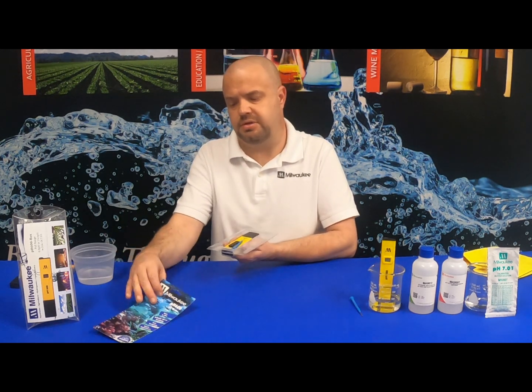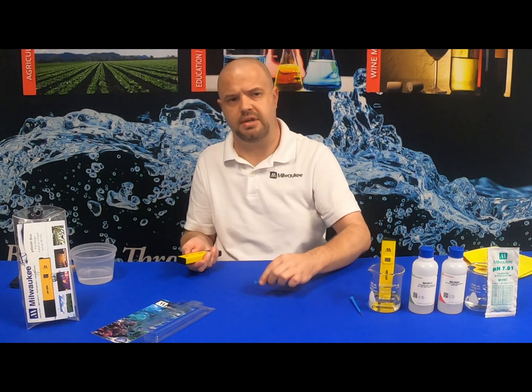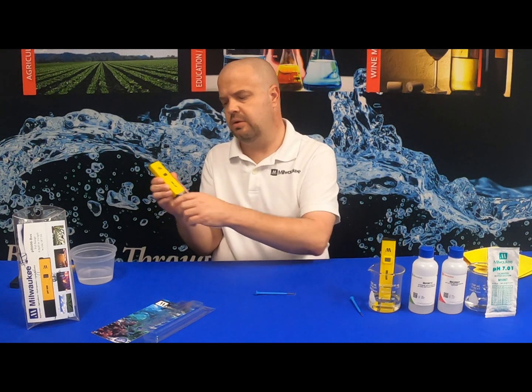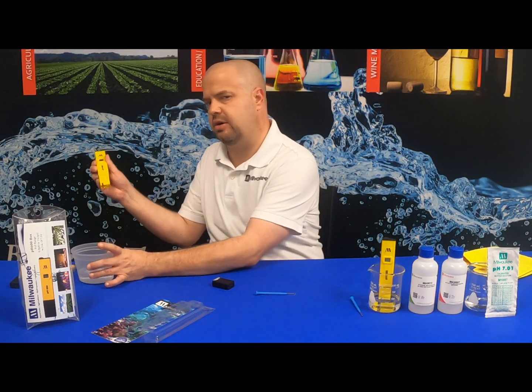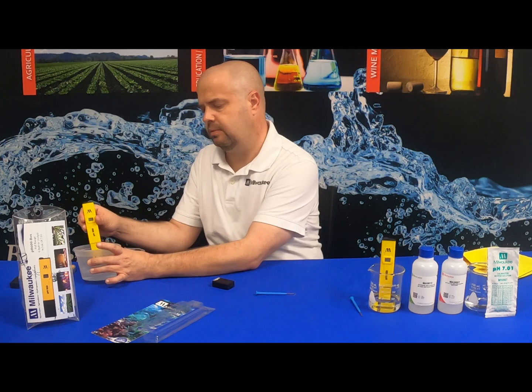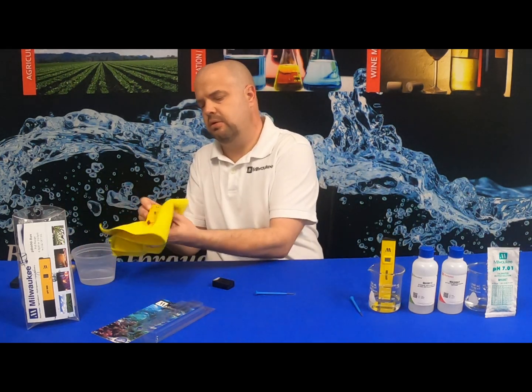Just going to remove the blister pack here. Your calibration screwdriver — just set that to the side. Notice we have a little bit of crystallization. We're simply going to remove the cap. I've got a container of warm water right here, just going to stick it in for a second, swirl it around, and then we're simply going to dry it off.